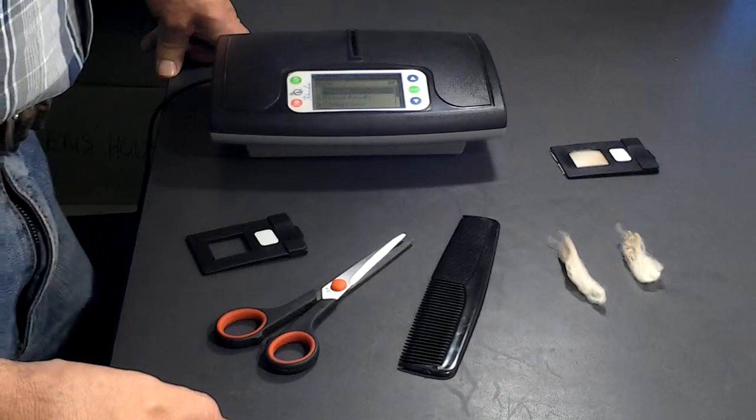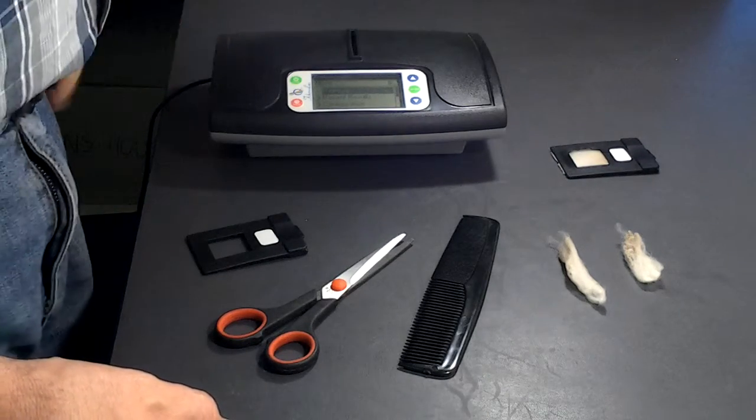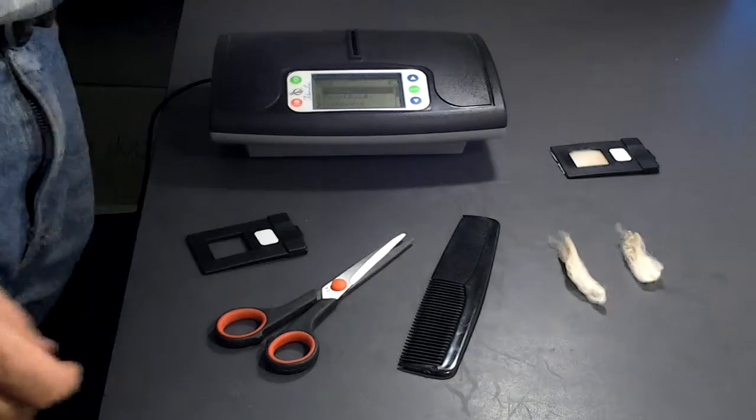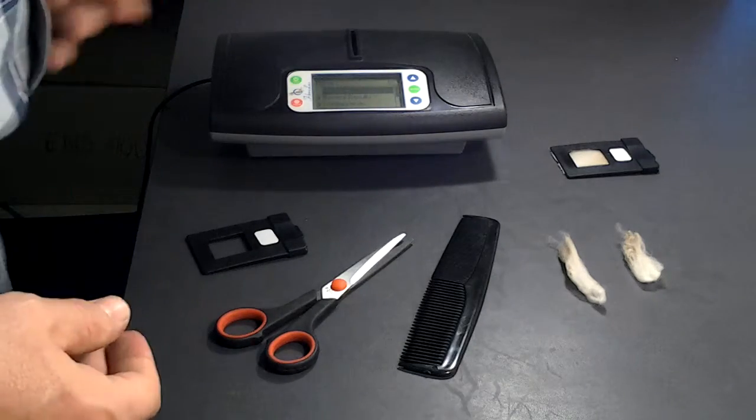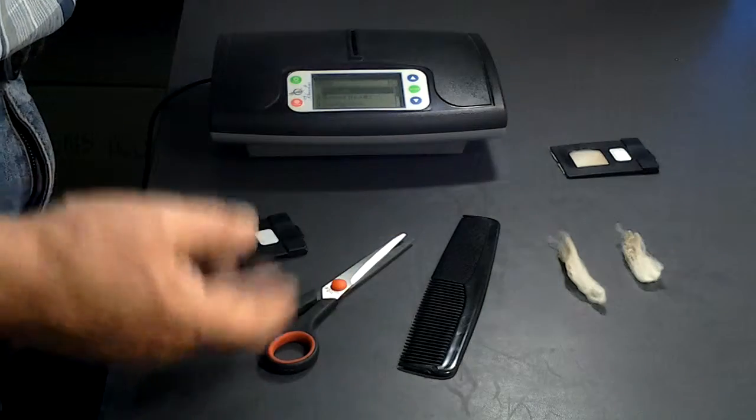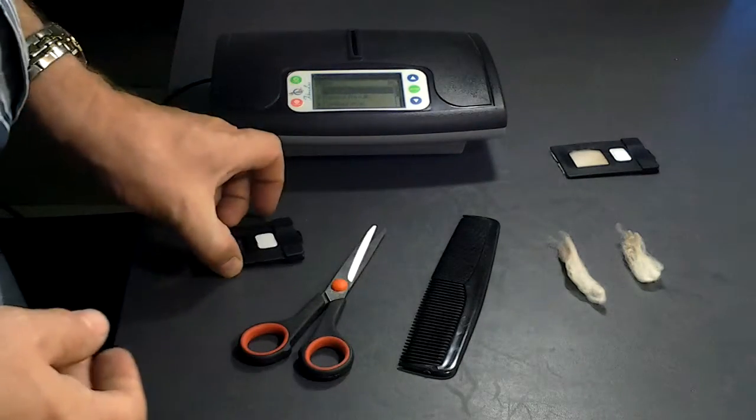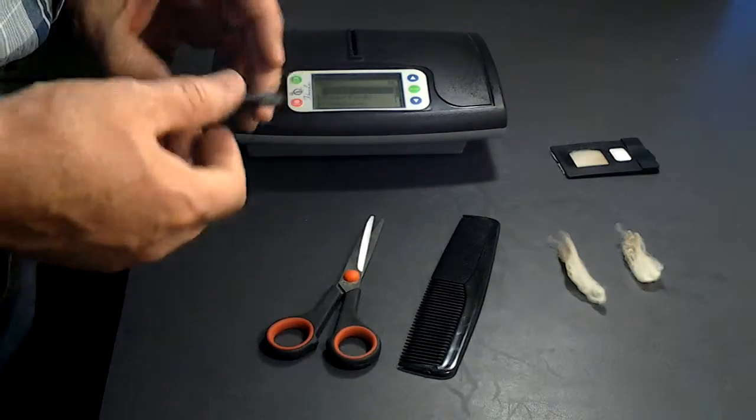An important part of taking measurements with your 5LX micrometer is sample preparation. And for that you would need a comb, scissors, and one of the sample holders provided with your meter.